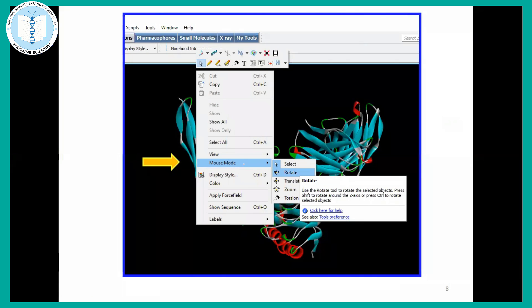For mouse operations, you just have to click the right button and you may select these features. If you want to do the rotate, zoom in and zoom out, you may do these things from here.